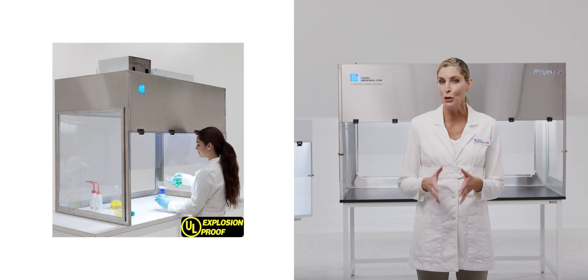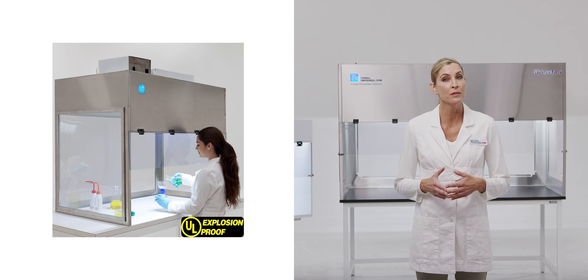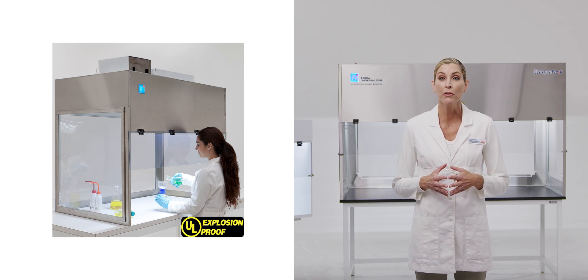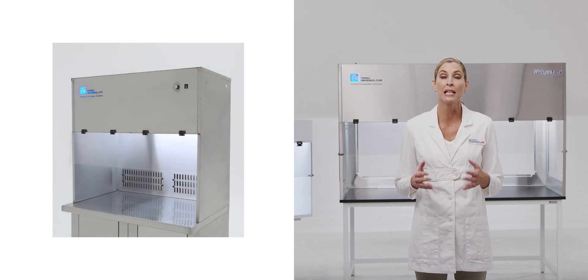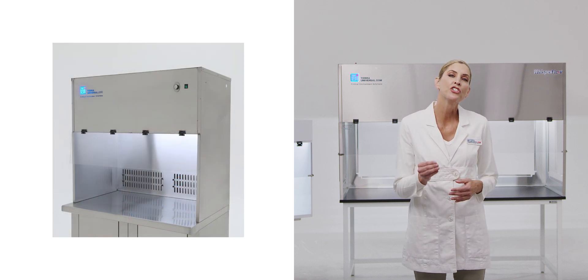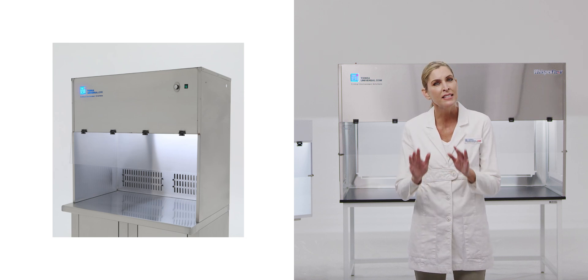Terra's Explosion-Proof Benchtop Hoods are rated for Class 1, Division 1 hazardous spaces involving flammable fumes or dusts. Terra's Benchtop Recirculating Laminar Flow Hoods feature an adjustable back plenum to minimize air turbulence and extend filter life.